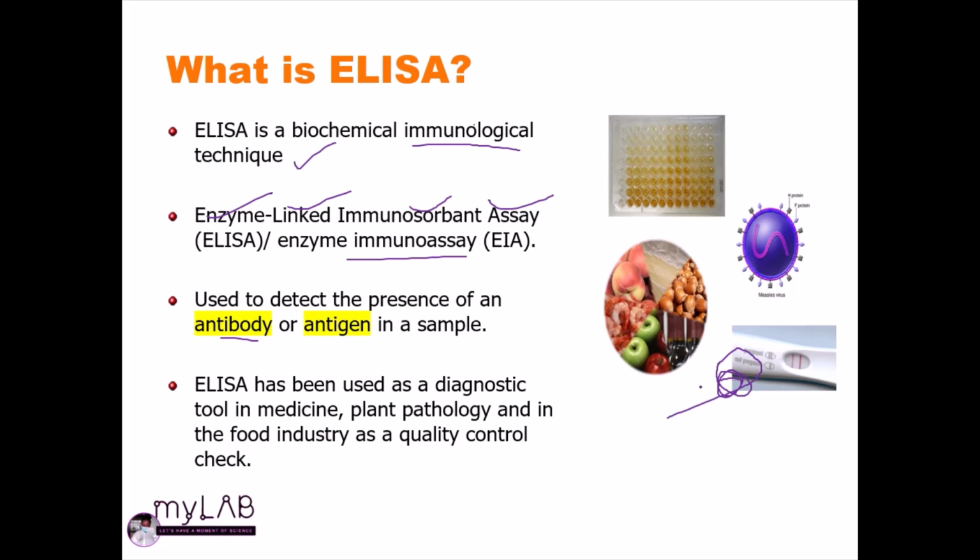I used an ELISA-based principle, because I used an antibody that was conjugated to HRP, and then I was adding a substrate called TMB for color development, so that I could visualize positive reactions and distinguish them from negative reactions. So kindly check that card that I'm putting up here. It will help you visualize what I mean by ELISA being very dynamic.